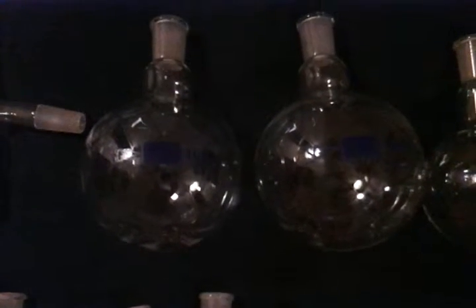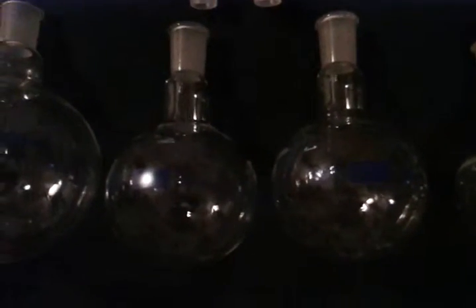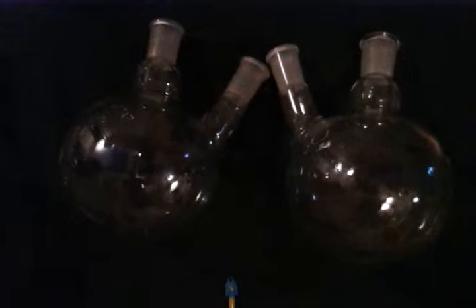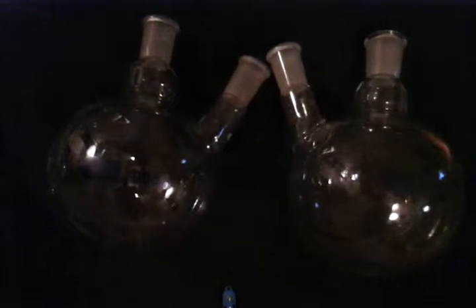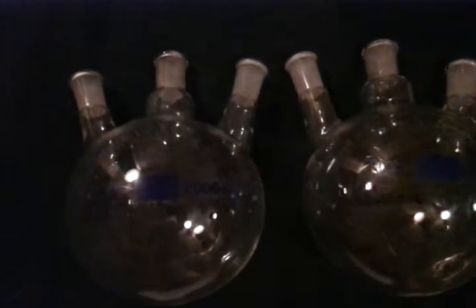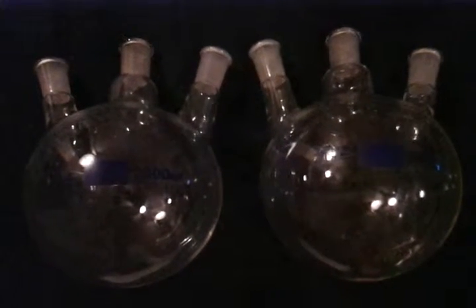2 1000mL round bottom flasks, 24/40 joint size; 2 500mL round bottom flasks, 24/40; 2 250mL round bottom flasks, 24/40; 2 two-neck 1000mL round bottom flasks, 24/40 joint size; and 2 three-neck flasks, 24/40, 2000mL total.